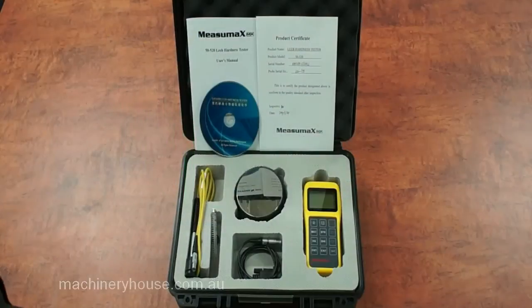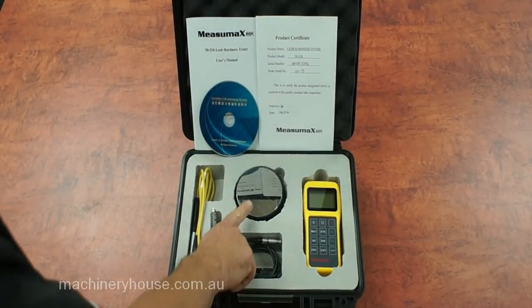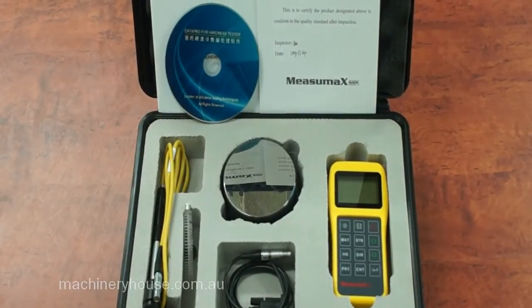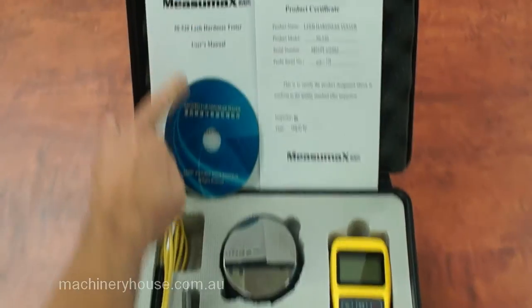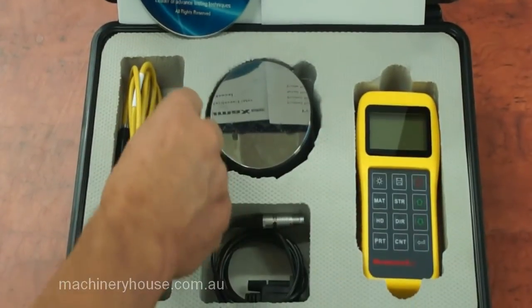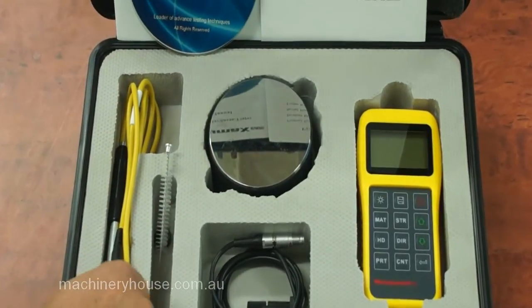The standard inclusions with this device is your test piece, software for data collection, instruction manual, product certificate from the factory, the cleaning brush, and the probe.